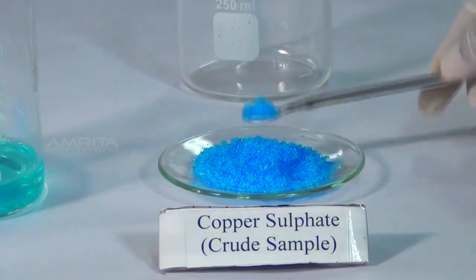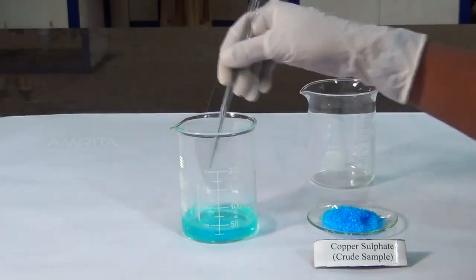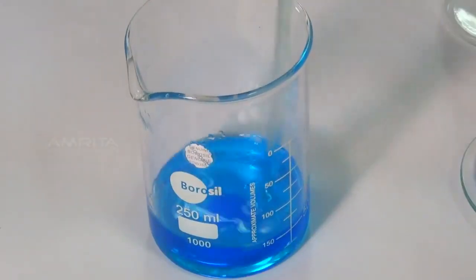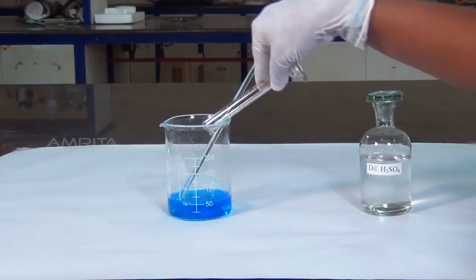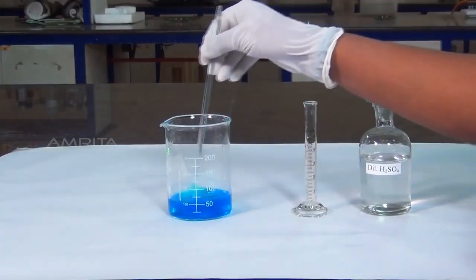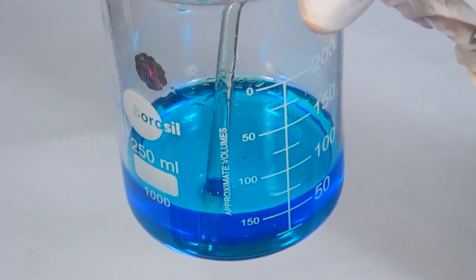Add the powdered sample several times till a little of it remains undissolved in the beaker even if it is stirred for some time. Now, add about 3 ml of dilute sulfuric acid to the solution using the measuring jar and gently stir the solution to make it clear. This prevents the hydrolysis of copper sulphate.